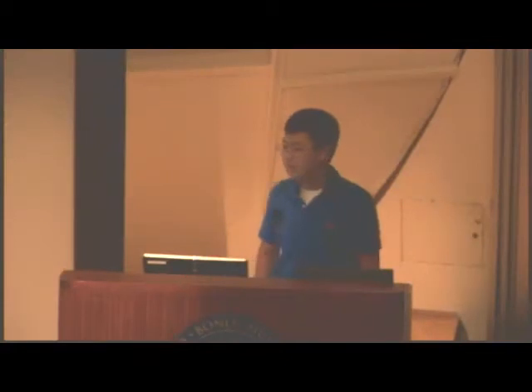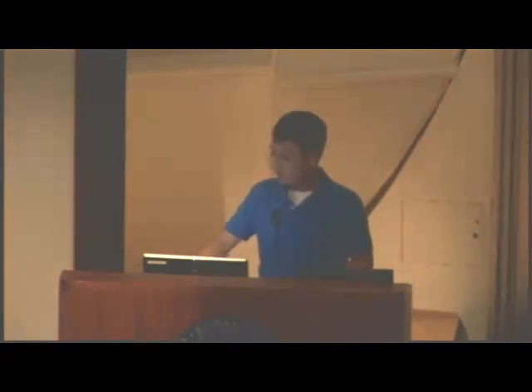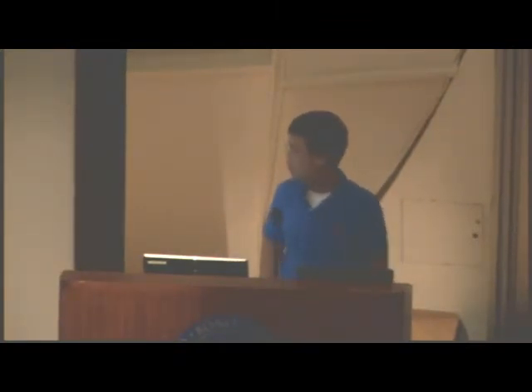I didn't get the results that I wanted. I did it again for 53 minutes. For this, it's basically trial and error because you can't really predict how much it'll go up. Since it's not a linear graph, you can't do it. It grows exponentially. So after 53 minutes, I found my results that I wanted.